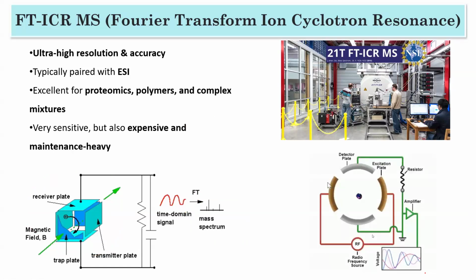Okay, so here is the example. You can see this example. Some molecular ions are trapped in this mass analyzer. Now you see what's going to happen.